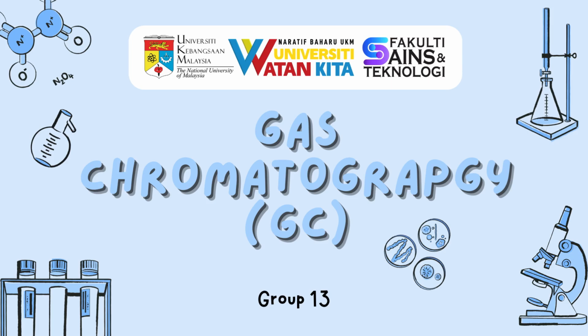Hello everyone. Today, we're going to explore an important analytical technique used in chemistry called gas chromatography.